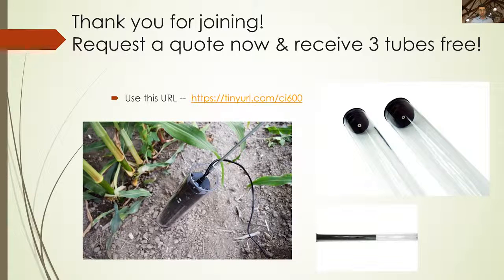All right, the next question is, did you experiment with this technology with vegetable crops? Yes, actually, as you saw in India, it's being used with maize. In the picture, I believe it's still on the screen, it's being used with corn and corn rows, but it's also been used on squash, beans, tomatoes. Actually, the list is very, very long. Since the 600 has been in use for over 10 years, it's been well documented. The 602 has only been around for less than a year now, but it is a fairly similar instrument, and it's getting very similar research.